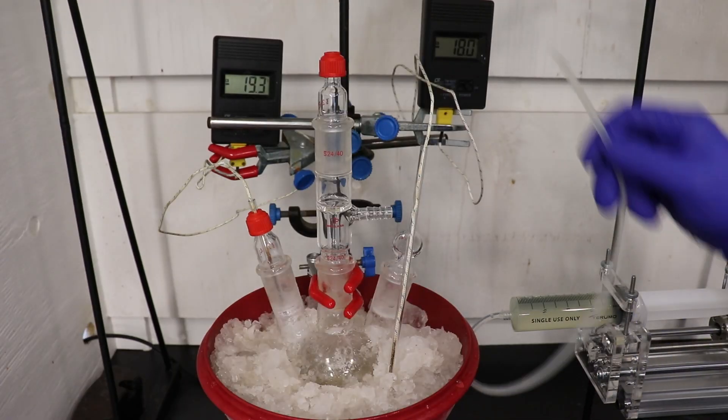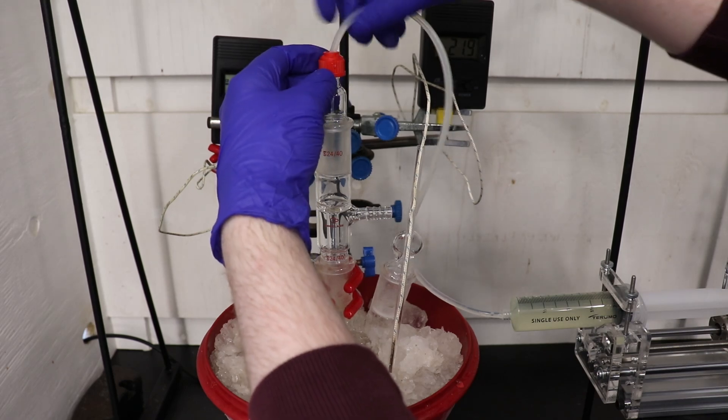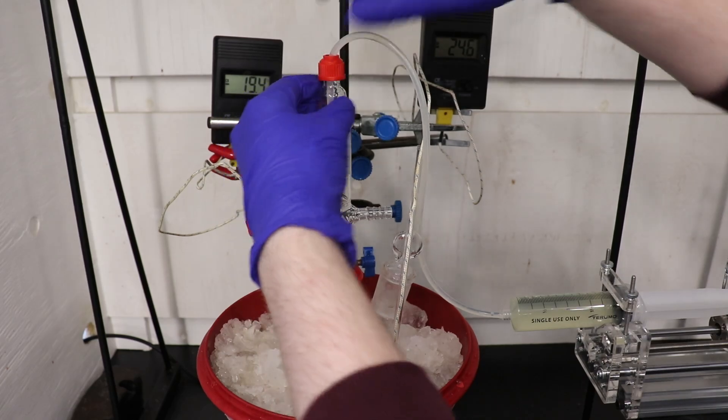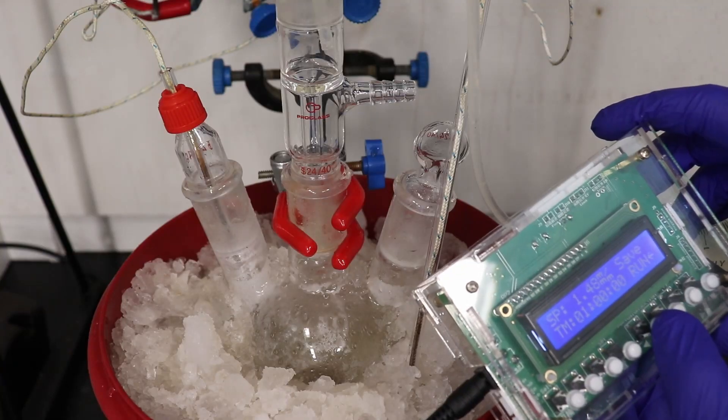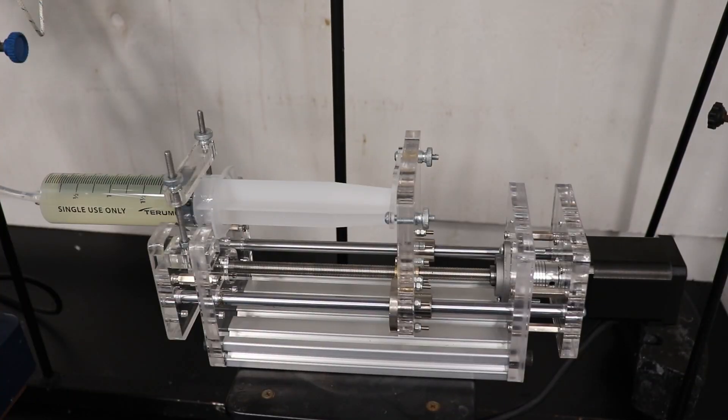Soon after, the internal temperature of the flask reached nearly negative 20 degrees Celsius. I then set up the last part of the apparatus, feeding the outlet tube of the syringe pump in through a thermometer adapter on top of the flask. I then switched on the syringe pump, so beginning the 1 hour addition of the sodium nitrite solution.